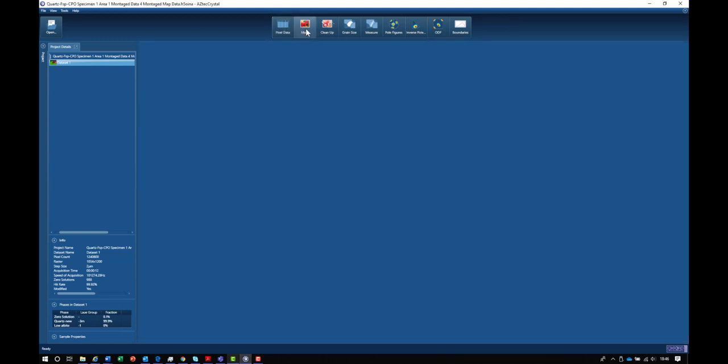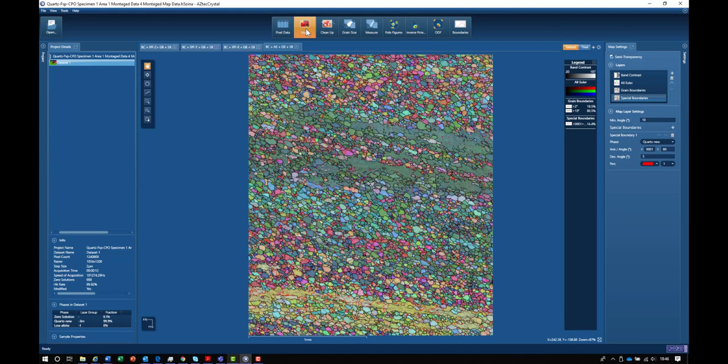I'm going to switch to the map view. In its simplest form, we take the three Euler angles and apply a red, green, and blue color to the three angles.